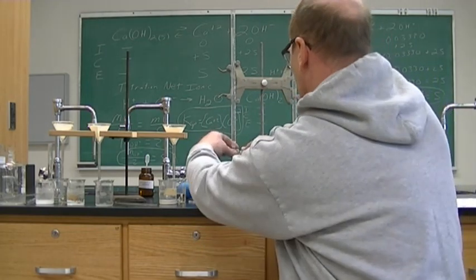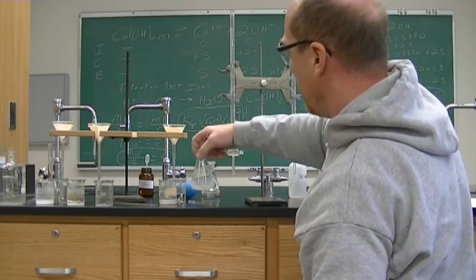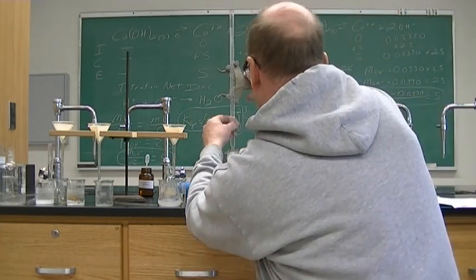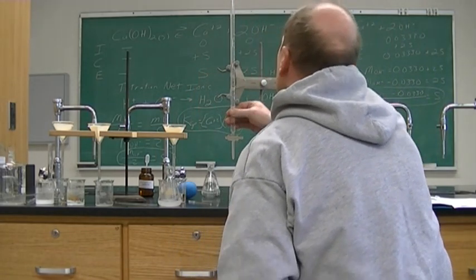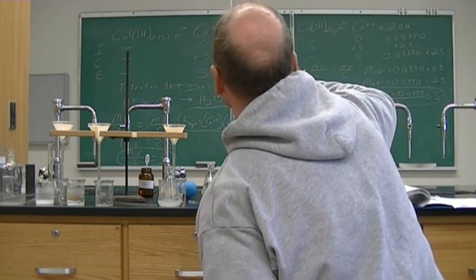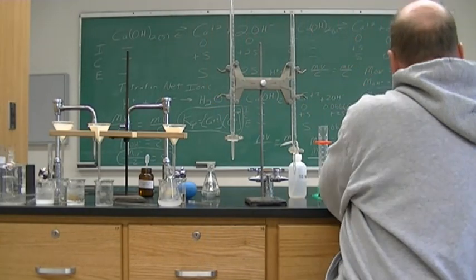Now we're really close. All right, so one drop changed it from a pink to a colorless solution, and our volume is 15.95.